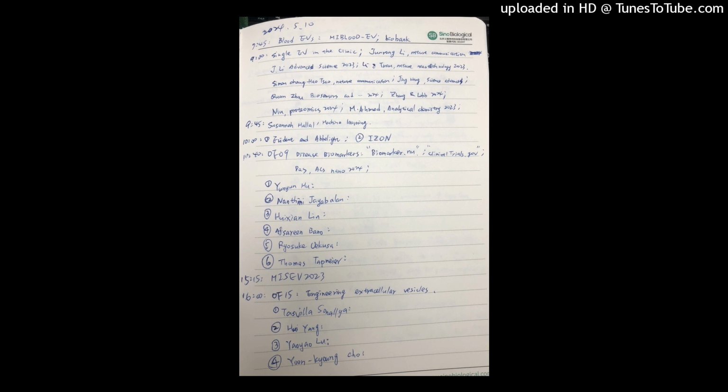But considering that PBA technology can simultaneously detect 200 proteins at a time, there might be potential steric hindrance from multiple antibody staining. Thus, we exploited the NFCM to validate the expression levels of every single protein at the single particle level, one at a time. Take IgG1 for example. NFCM could simultaneously reveal the expression proportions and the median fluorescence intensity.